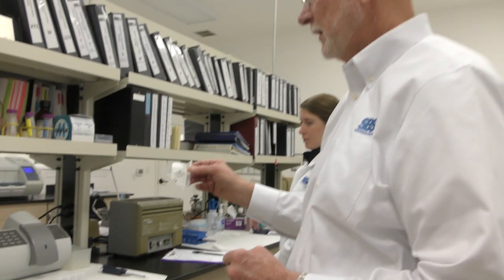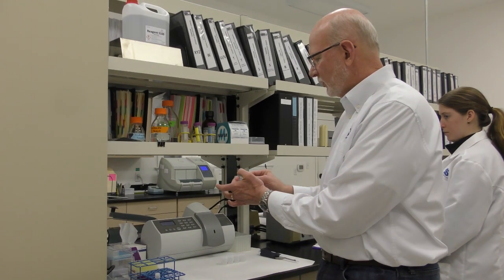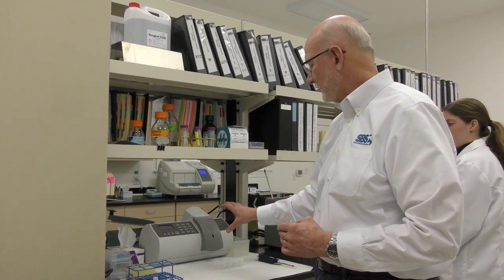So now this instrument has an ultraviolet light source, which is pointed at this viewing window inside the machine with a photodetector cell on the other side. And the only thing that this instrument sees is fluorescing sperm heads. Most instruments that measure sperm concentrations using a photometric technique are measuring how much light is blocked by the semen sample, and you therefore can't use those instruments with extended semen because the extender itself will block the light. So what this does is allow us very accurate counts of sperm cell concentration in extended semen.